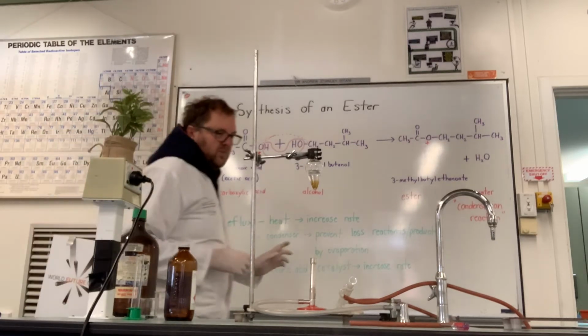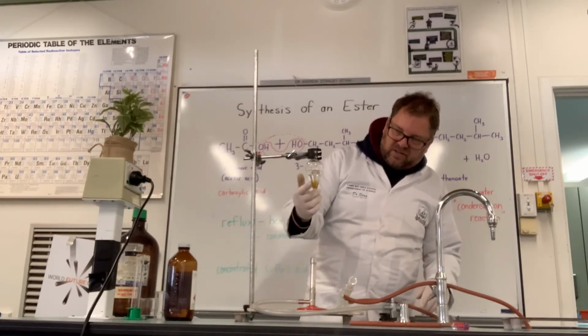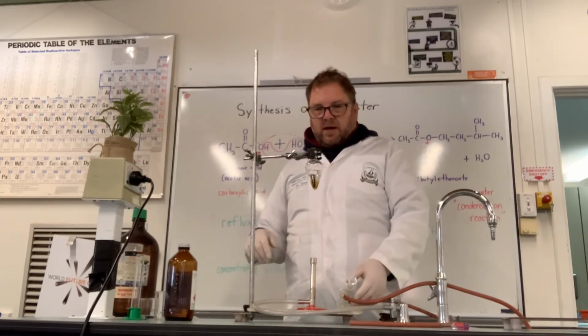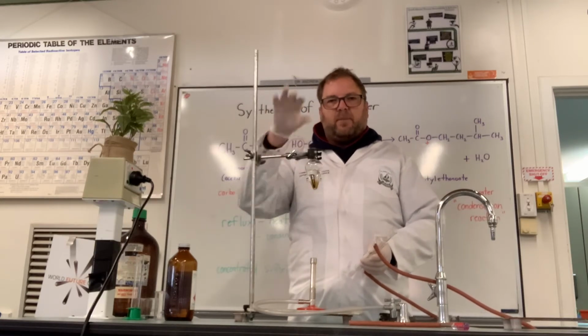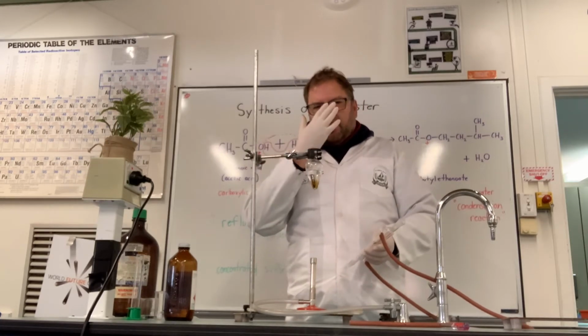Okay, you don't want someone to accidentally touch that. Now as you see, we're getting a little bit of discoloration happening in here. Now, if we just heat that, this reaction is very slow. So what will happen is all those reactants will just boil off, evaporate, turn into gas before they can form the ester, and that's not much good.